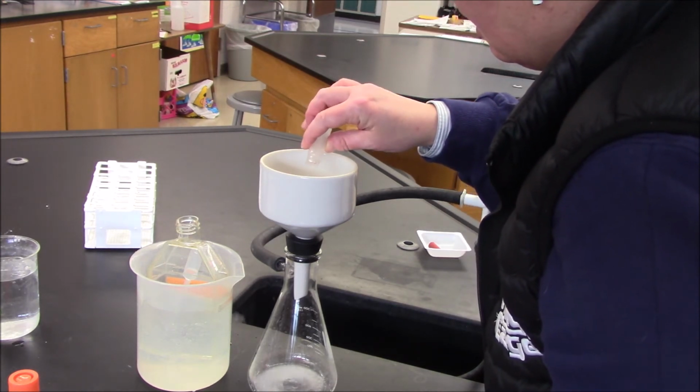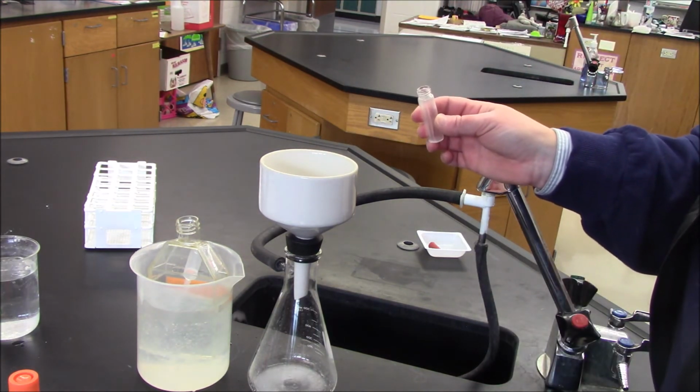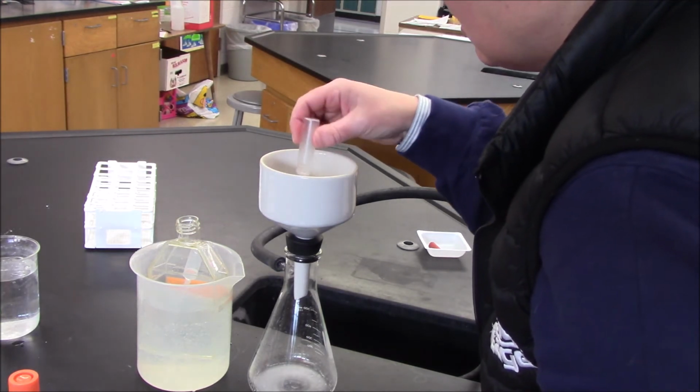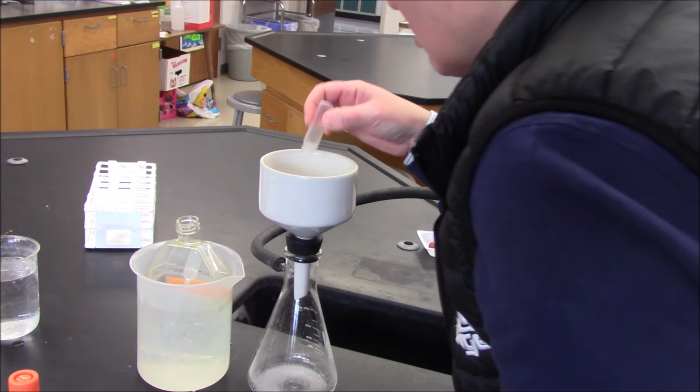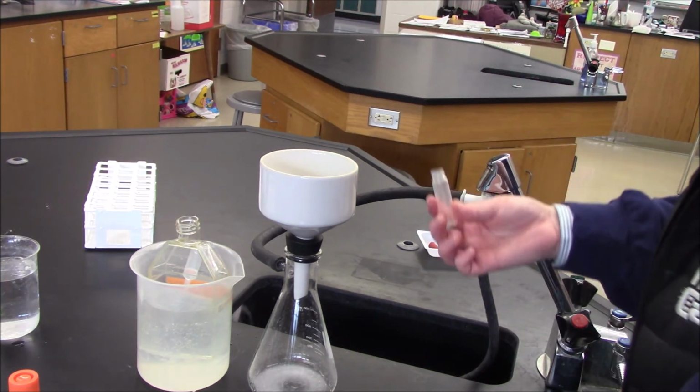This is not... This does not look good, as I feel like it just went straight through my filter paper. Not good.